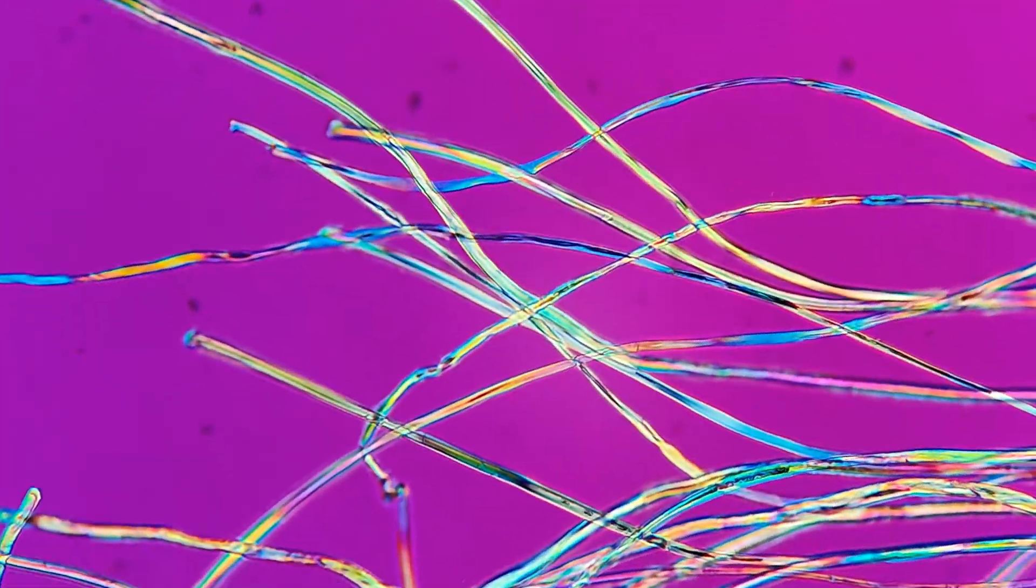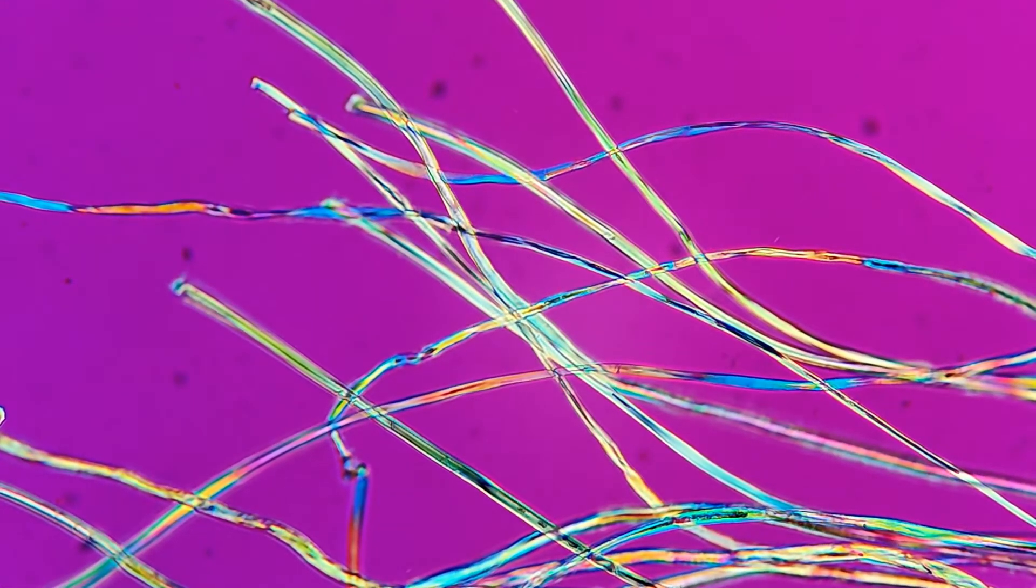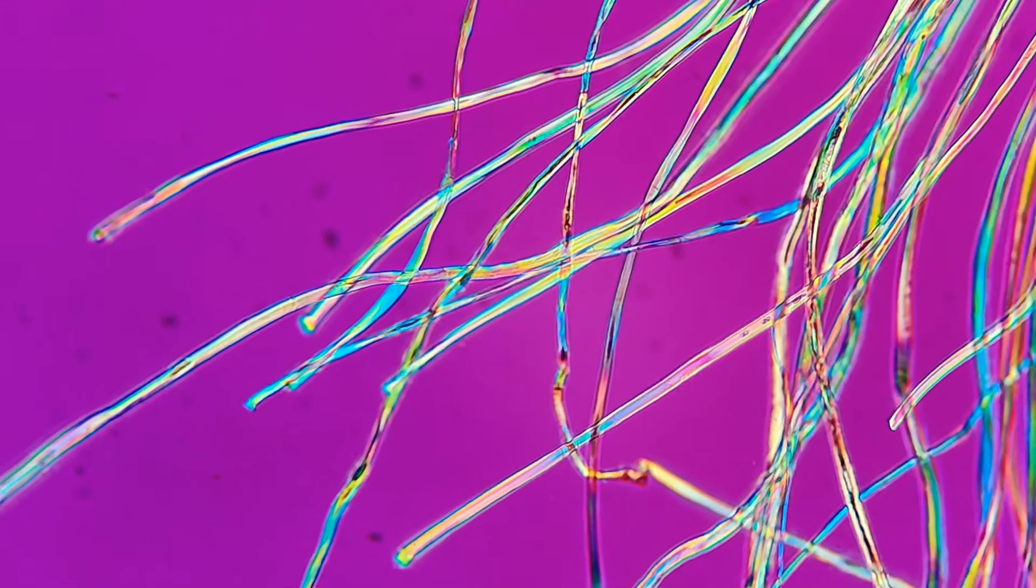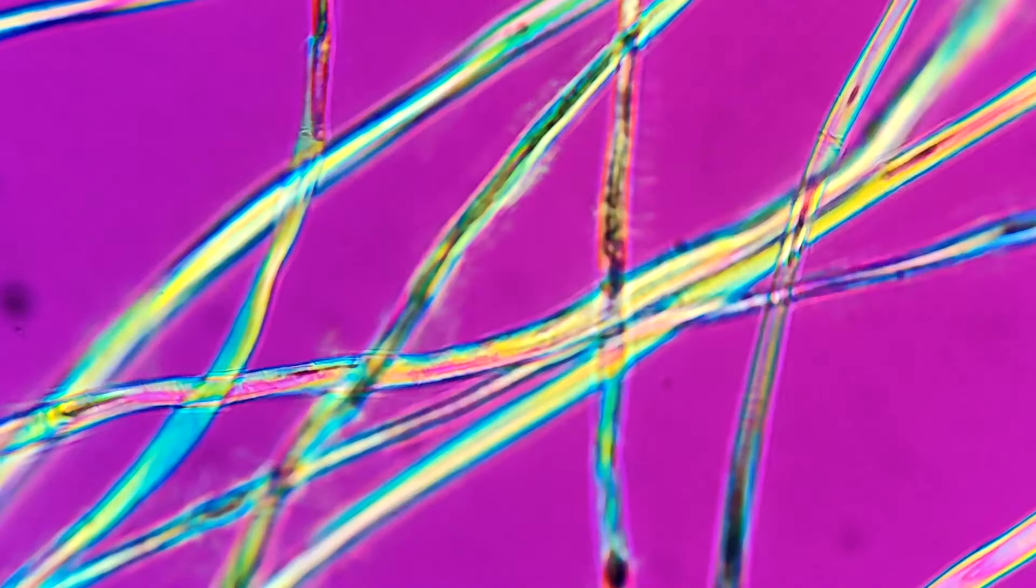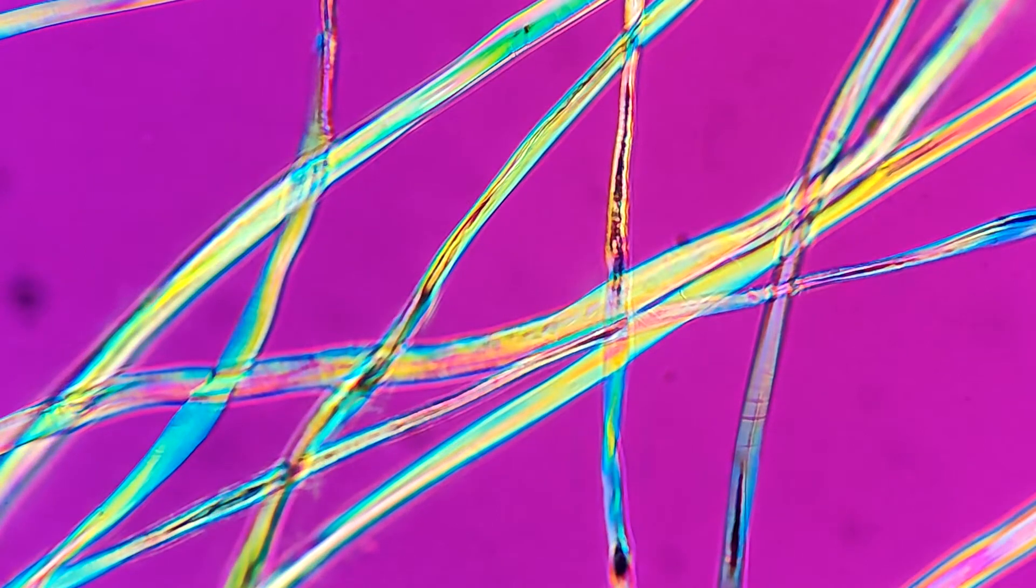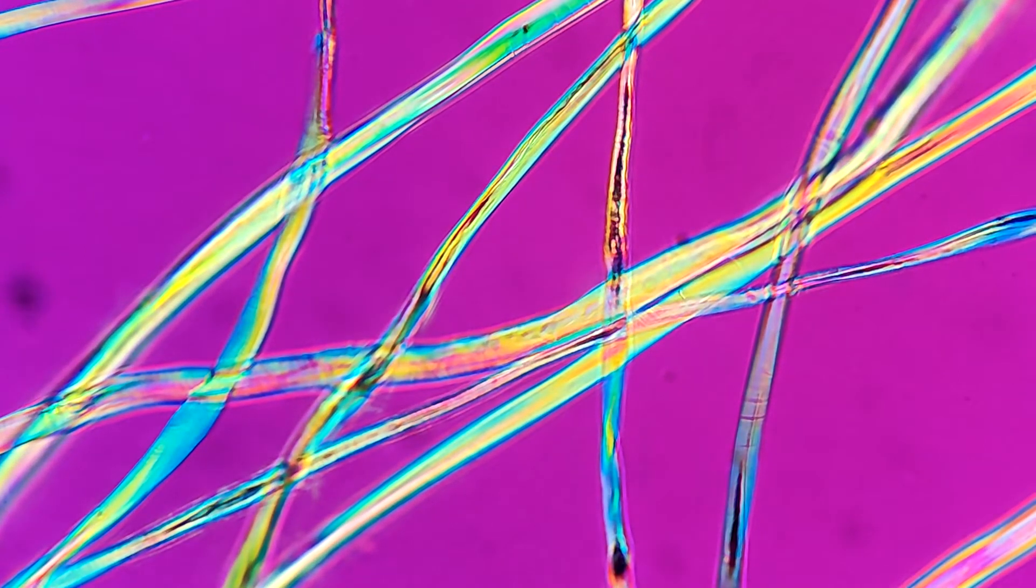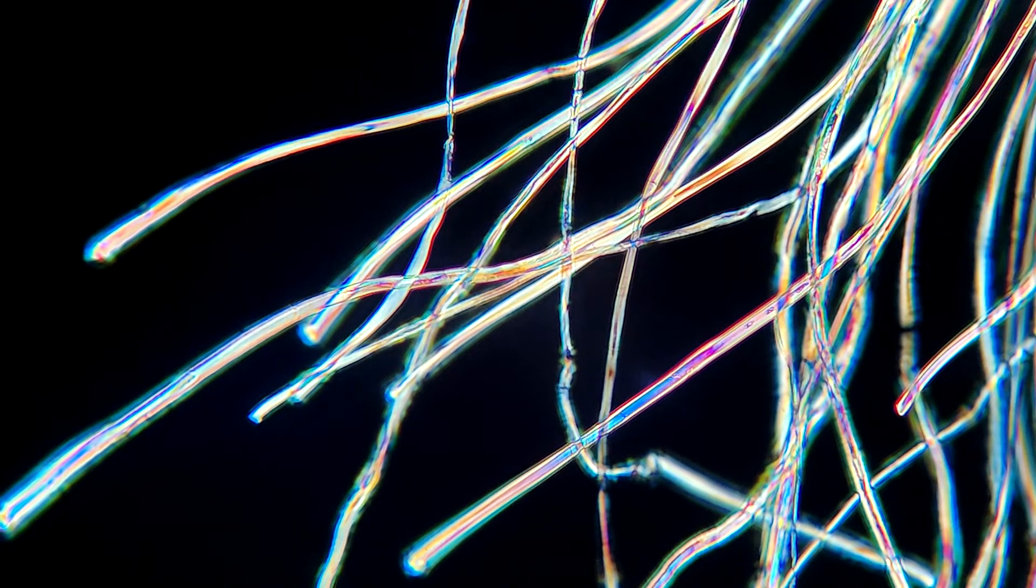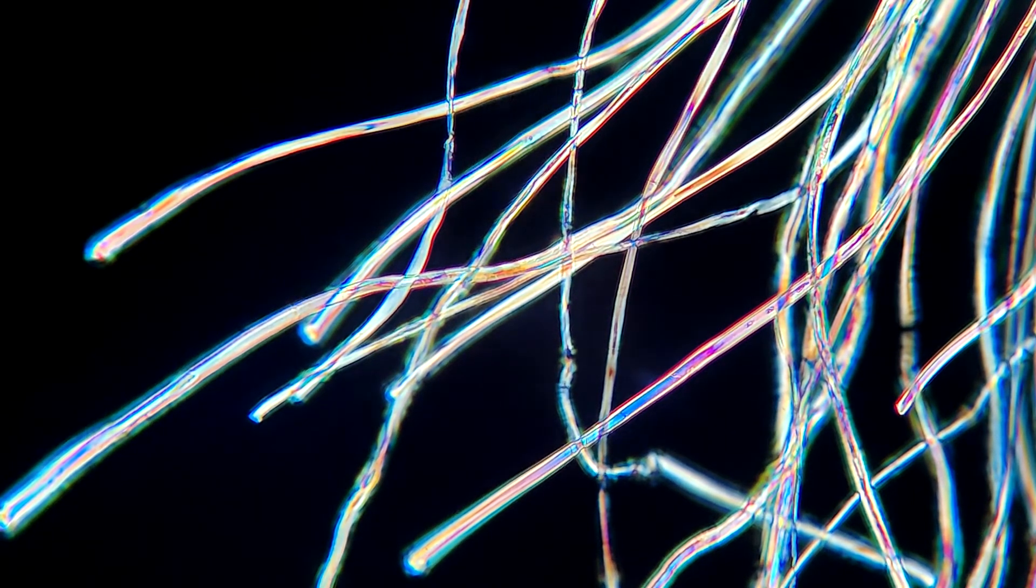Characteristics of cotton include a ribbon-like cross-section and a positive sign of elongation. Processed cotton fiber tends to exhibit kinks, dark patches, and striations across the fiber as a result of damage incurred during processing. Cotton also displays an undulose extinction during examination with cross-polars.